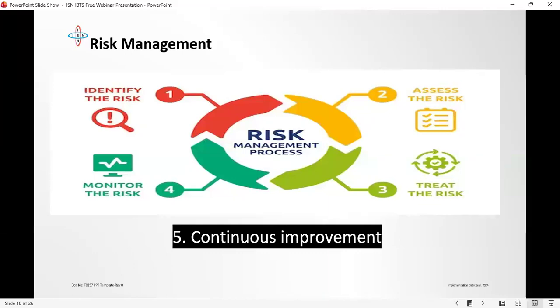You must not look at it and say, there's this wire on the floor, it can trip somebody, and you overlook it. You need to treat it. Find a way of either stepping it into the ground so that it's not raised up, or put in a measure to remove that risk, because if you leave it inadvertently, something adverse may happen. And the worst case scenario is that it may lead to death. After you've treated it, you monitor that the thing that you've used to treat it is effective.